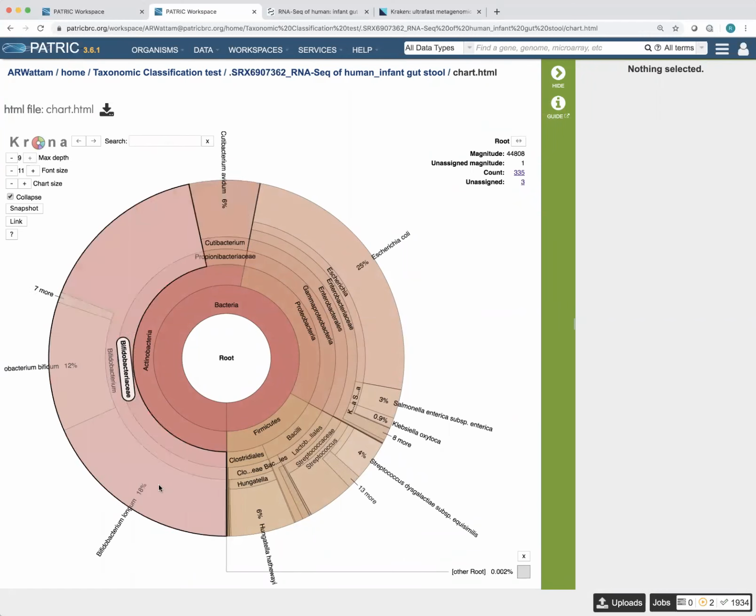So this one, it's got a different spectrum. Bifidobacterium, actually that's one of the crucial bacteria that babies have in their guts to give them vitamins and stuff. And actually one of the main components of breast milk is to actually feed these bacteria.